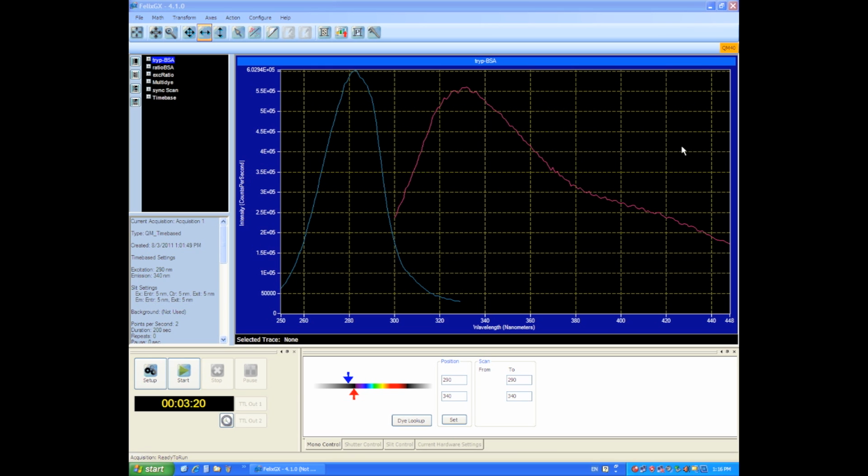Hello everybody. I'm going to go through a few other functions of the software, basically how to navigate through the data traces and how to navigate through the sessions and define regions, how to do some mathematical functions, and how to control the windows, and also maybe how to export some data from this program.